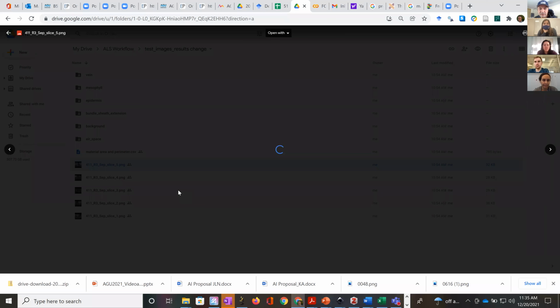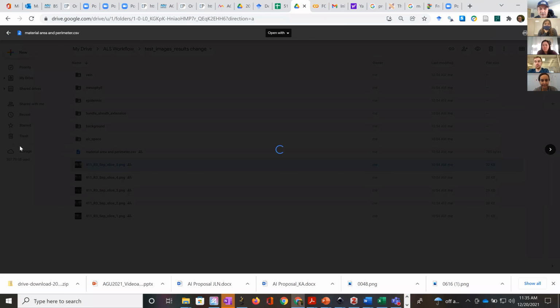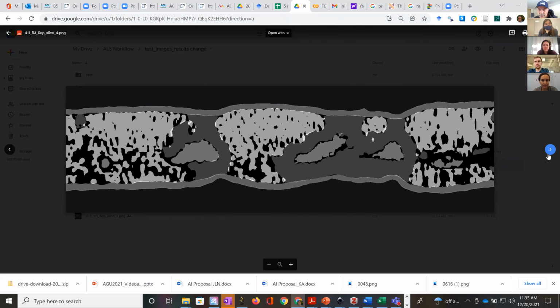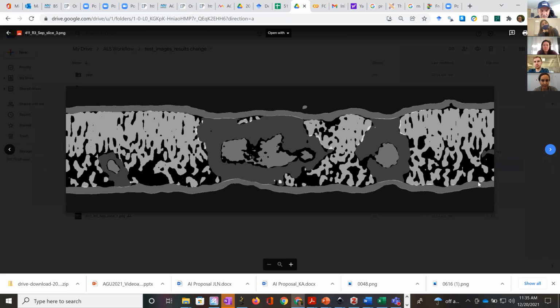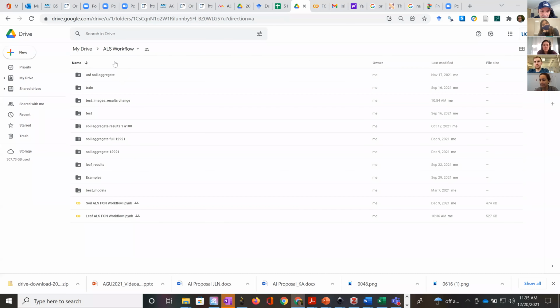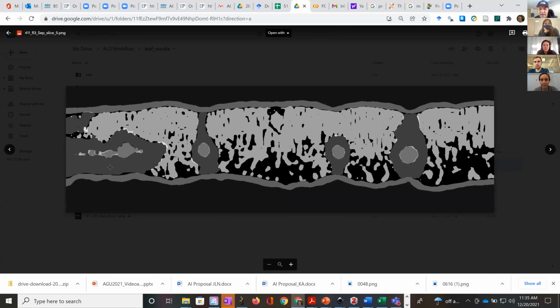Here's kind of what we might get. This is actually still pretty rough. I just made that one as well. Let me see if I can find a better one. Okay, so this is with 100 epochs of training. This is the output that you might get.